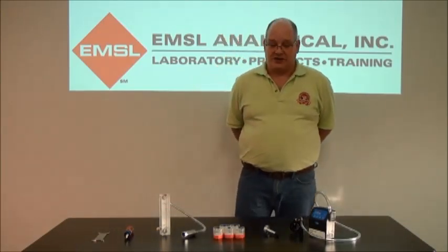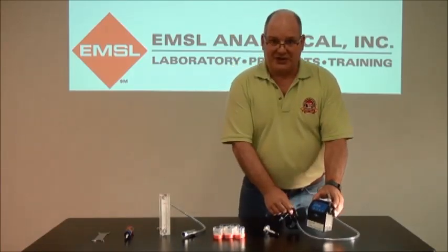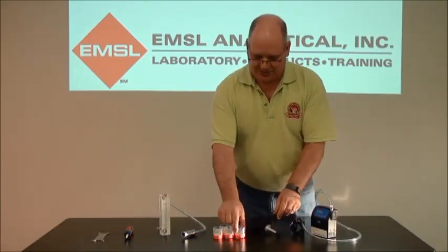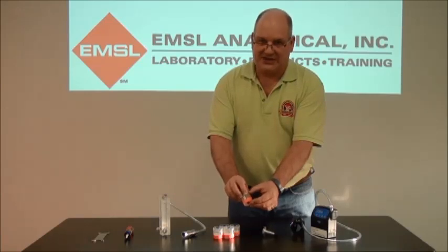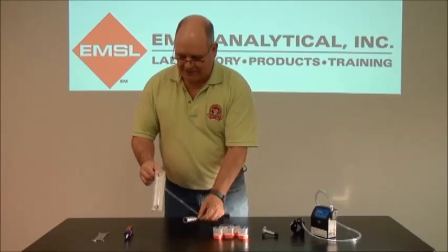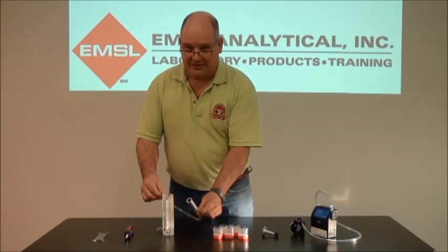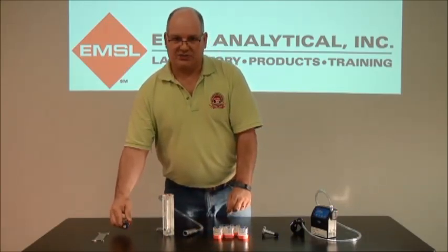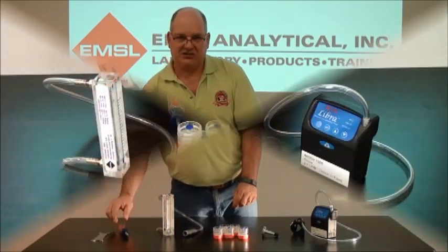First, get all your equipment together: a sampling pump with a cassette holder, a cyclone, dust cassettes, pre-weighed PVC, a three-piece flow meter such as this rotometer, which has an adapter on it for the cyclone. You're also going to need some way to get the cassettes open, such as a big screwdriver, cassette wrench, or car keys. Here's the procedure.